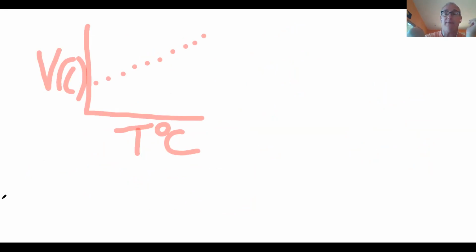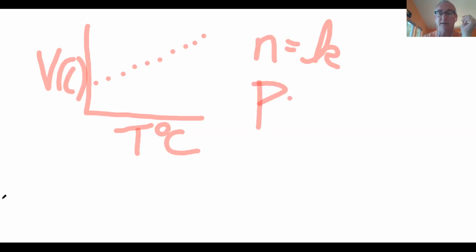So you're going to keep moles constant. That's going to be a constant number, whatever you decide how many moles you're going to use. And P is going to be constant because you're going to decide what pressure you're going to use, either a low pressure or a high pressure. That's also going to be a constant. So that's not going to change.